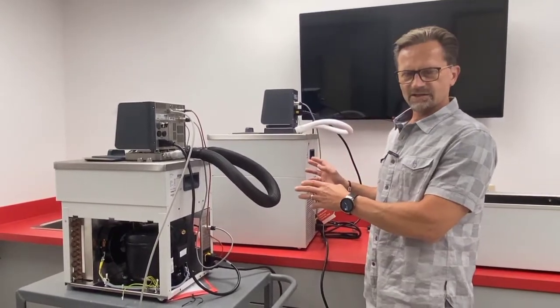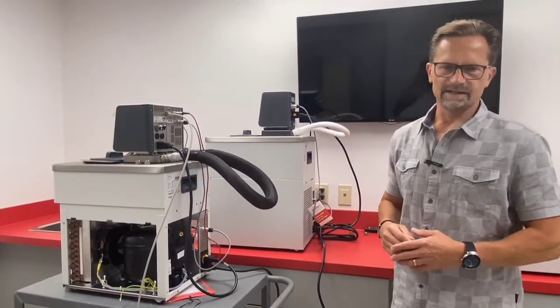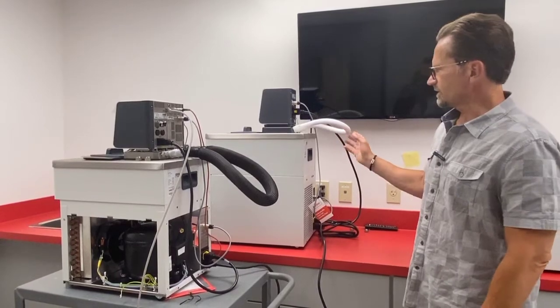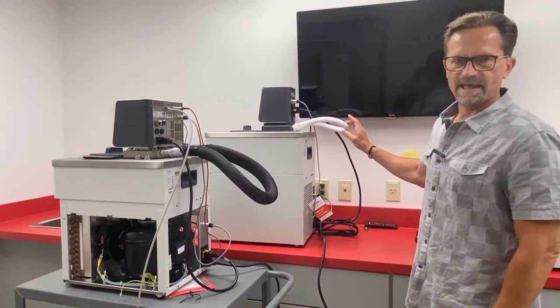Here we have two refrigerated heating circulators at minus 30 degrees C. This one we have uninsulated rubber tubing, and you can see it has turned into Frosty the Snowman.